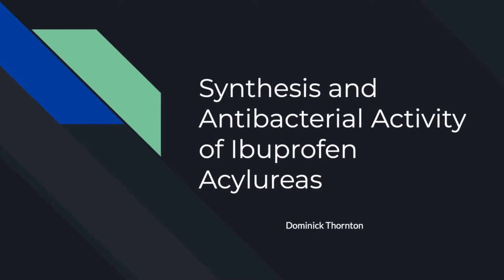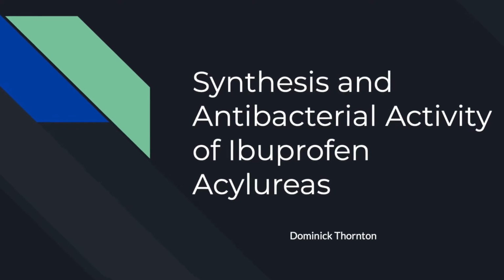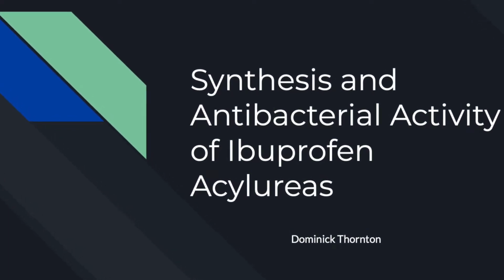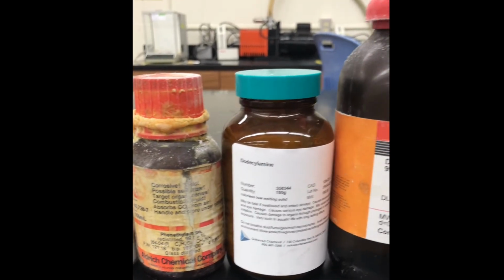What's up, everybody? My name is Dominick Thornton, and my project was synthesis and antibacterial activity of ibuprofen acyl ureas. Before I begin, here are the amines and amides that I use in all of my products.